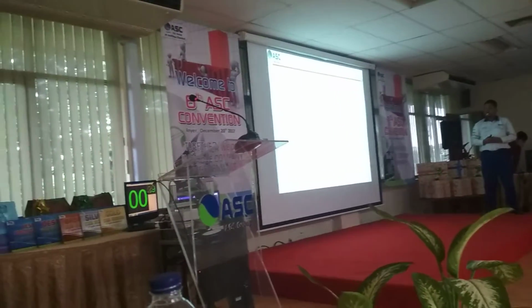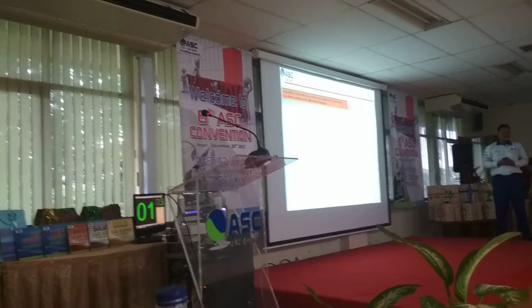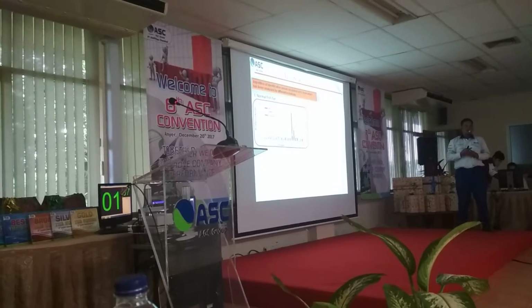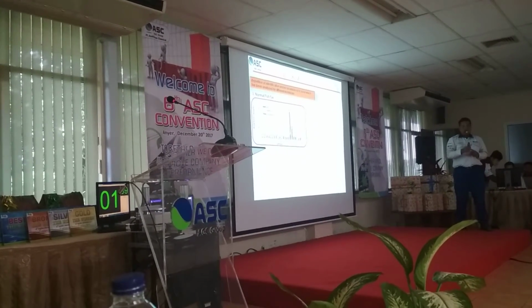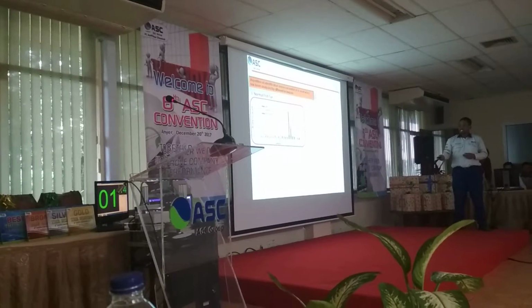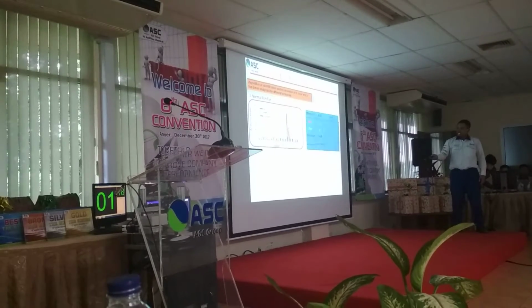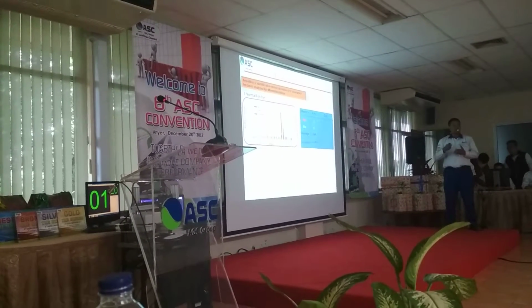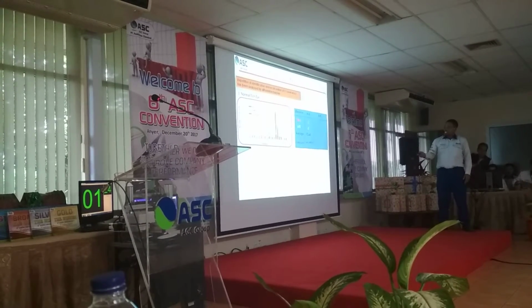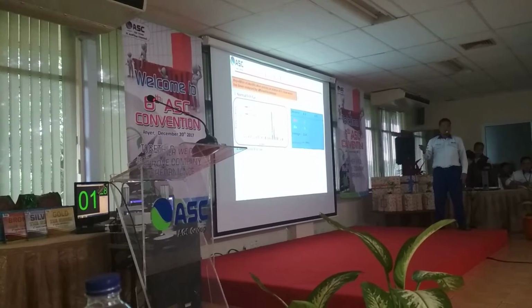As a background, we take a simple test. One sample is rolled and analyzed by one operator, and then analyzed again by another operator. In total, we got 22 data, and this is what we get: the differences between one operator and the other. For the normal fish eye, we get a max of 4 for the result of the analysis.